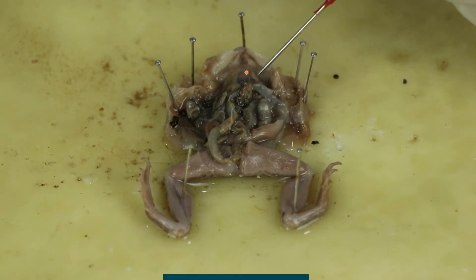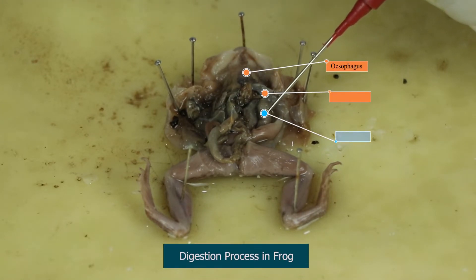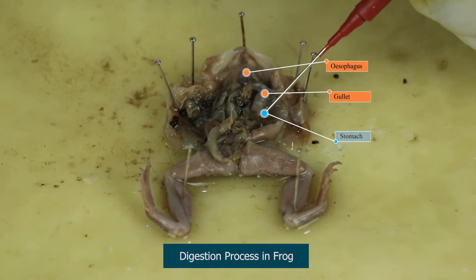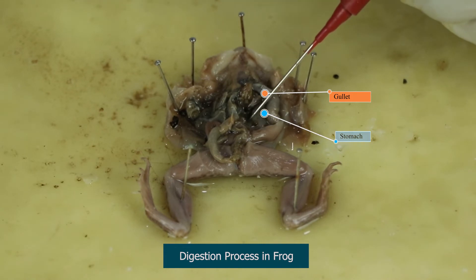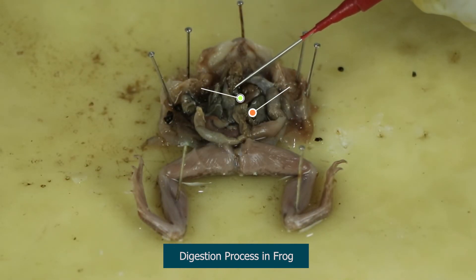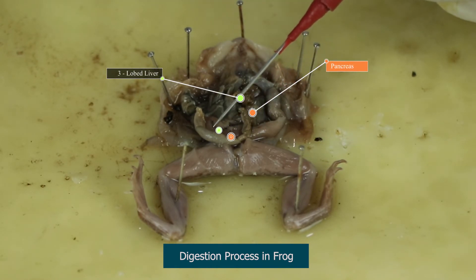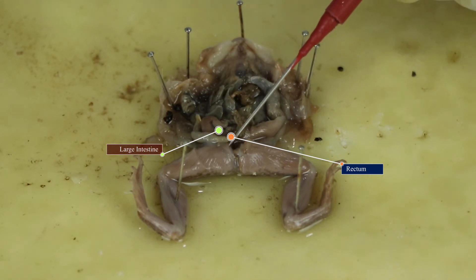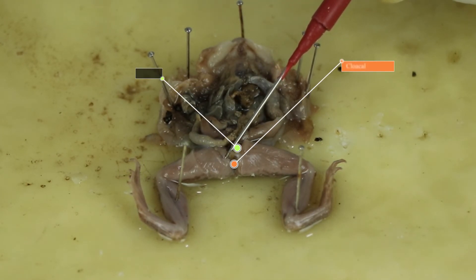The esophagus pushes food down the gullet into the stomach. Near the stomach, at the junction of the stomach and the small intestine, we see the pancreas. Around this area, we also see the three-lobed liver. Finally, we see the large intestine lead into the rectum, then into the anus, and then finally into the cloacal aperture.